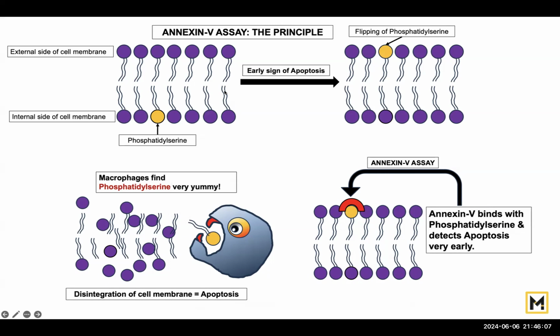However, the story reverses in apoptosis, and this is the most interesting part of this process, in that phosphatidylserine suddenly flips to the external surface of the cell membrane. And that is what makes it very interesting.